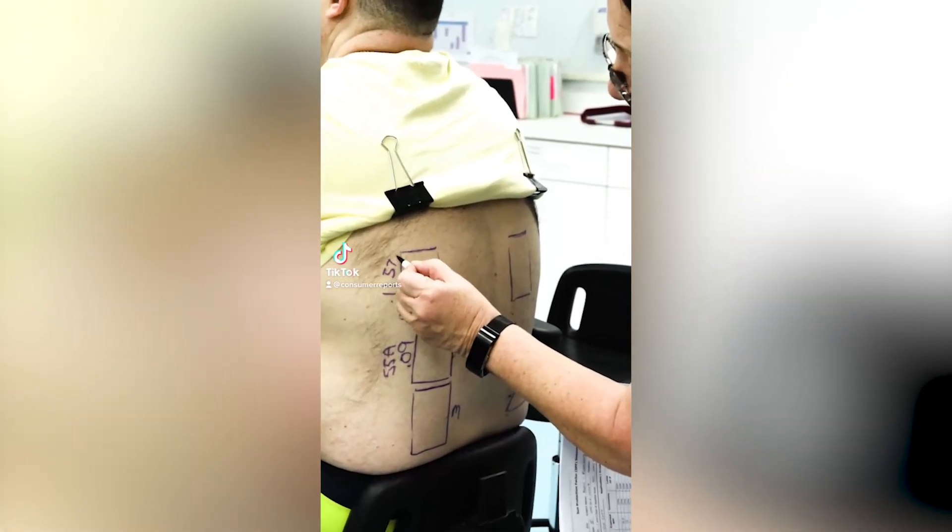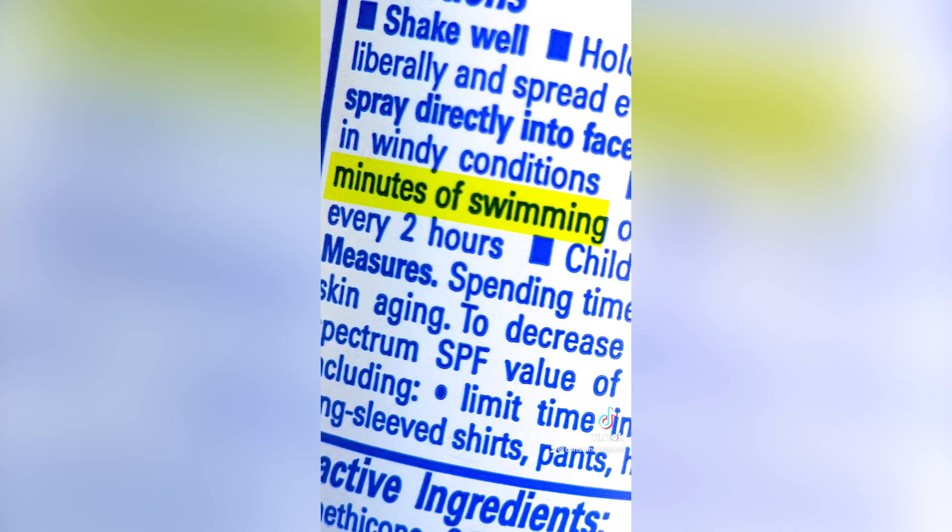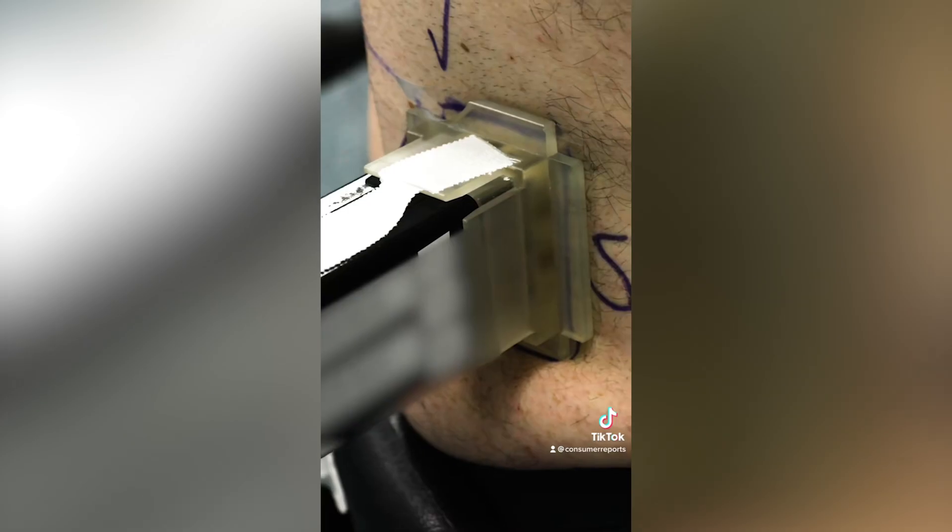Here's how we test sunscreens. Lotion and spray sunscreens are applied to the backs of test subjects, who then soak in a tub for 40 or 80 minutes, depending on the product's water resistance claim. The area is then exposed to simulated sunlight. The next day, trained experts examine the area for redness.